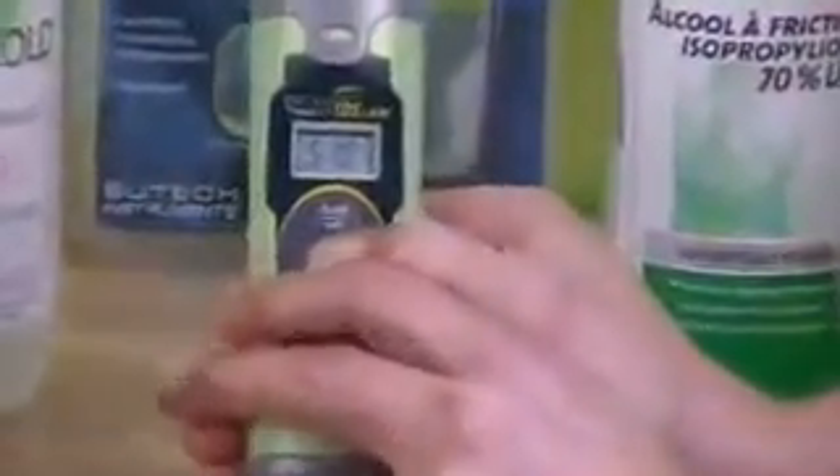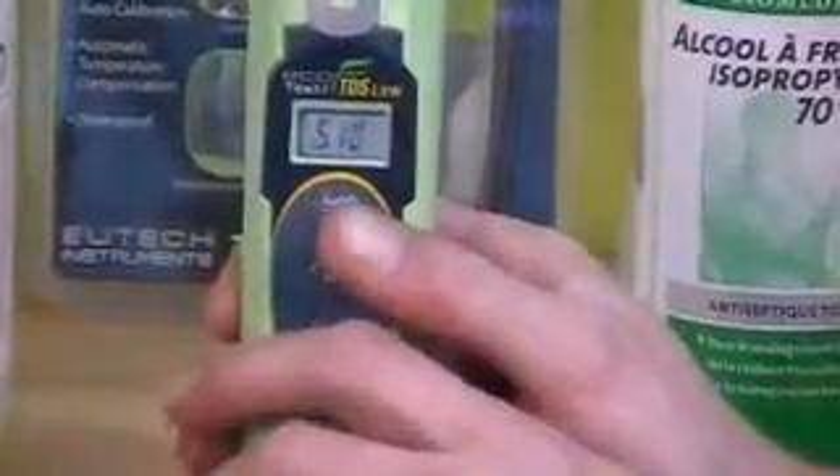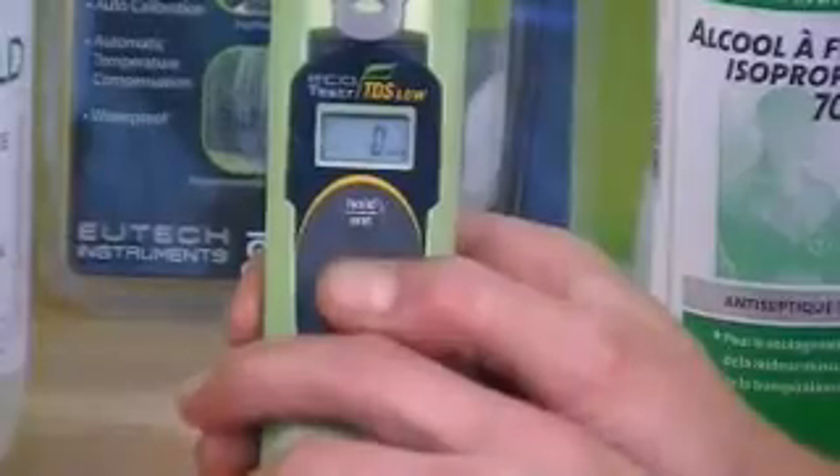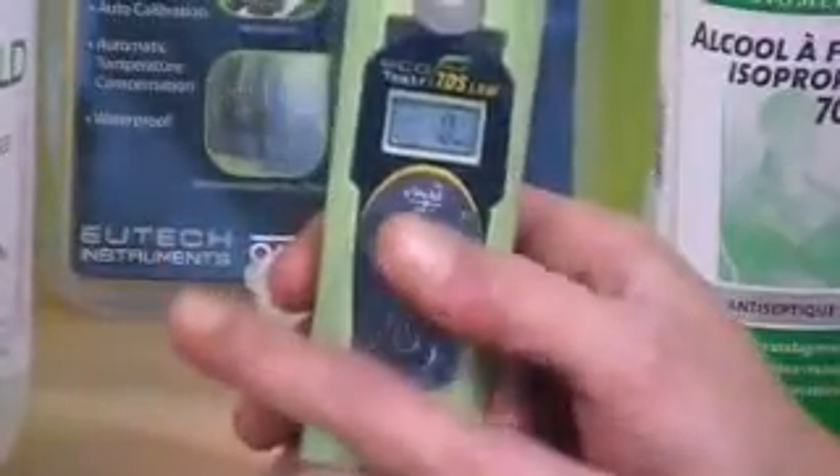Once you reach 510, you let it flash until it says 0 PPM — it's just going to restart. Right now, 0 PPM. After that, to calibrate it, you put it in your solution 1500.